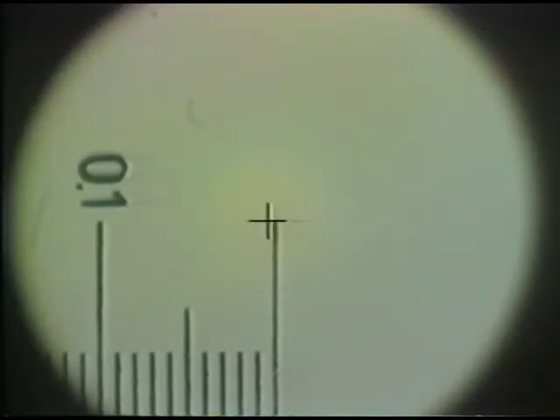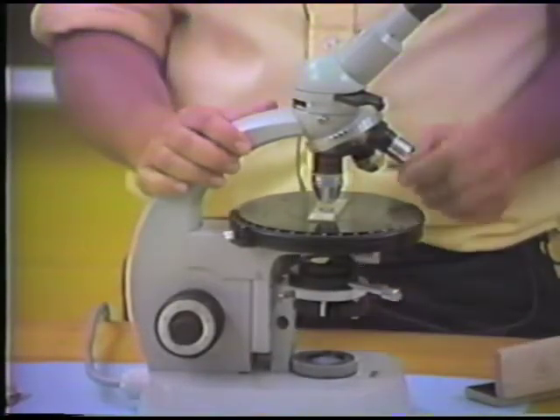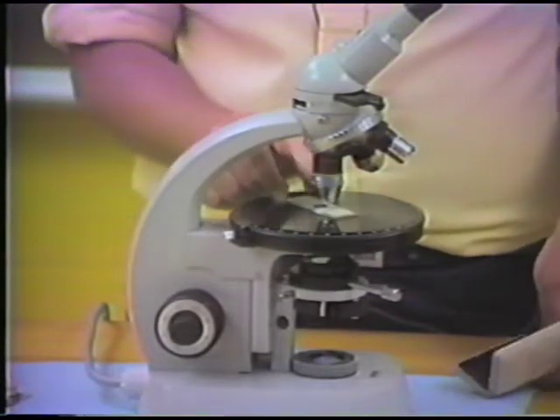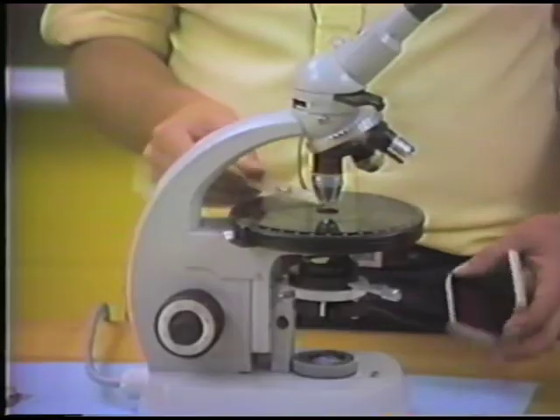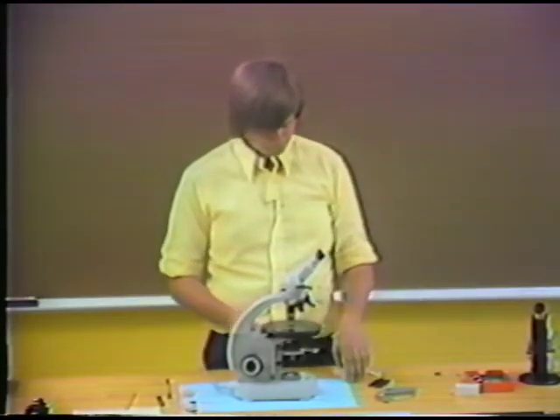Now the graduations are getting quite large, as you can see, and the distance from the center to the edge of the field of view is approximately 0.14 millimeters. These will be different on different microscopes. You should measure your own field of view on your own microscope and keep this as a reference so that you constantly know what the scale is of materials that you're looking at.